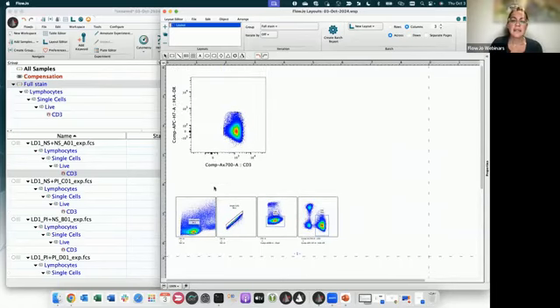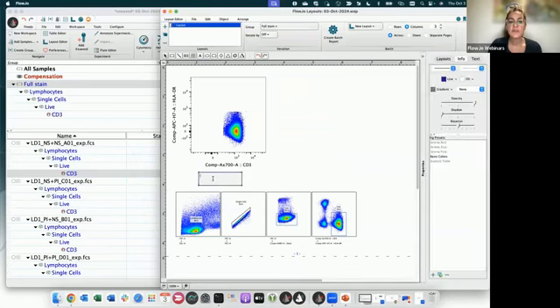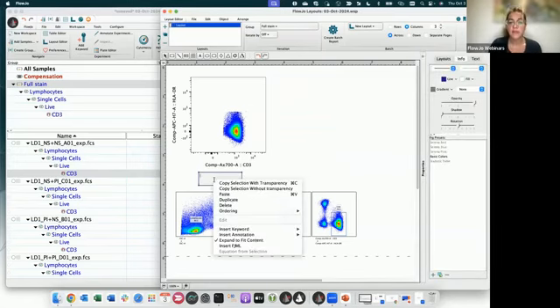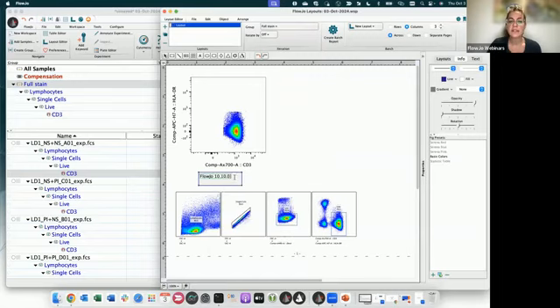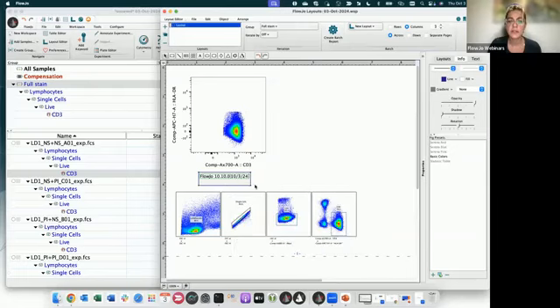I want to add some informations, for example, regarding my sample. I can create a text box. And whenever you're using automatic annotations, for example, if you right-click on the text box and you want to insert annotations such as the FlowJo version and the date, these are automatically inserted by default on the date that you are working on.